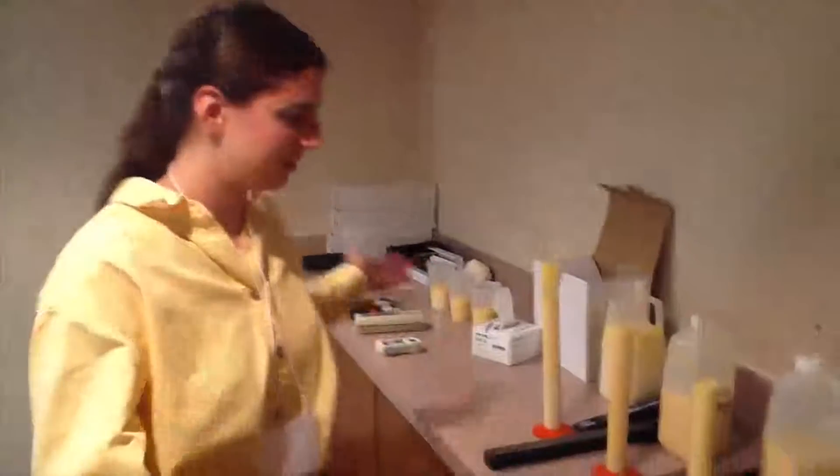I'm Sonya Gelsinger, a first year grad student with Dr. Heinrichs at Penn State. Today we're going to be talking about colostrum quality and how to measure that, and how different dairy farmers can do that on their farms.